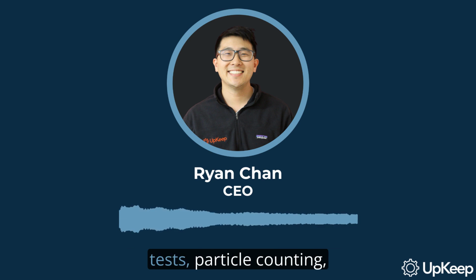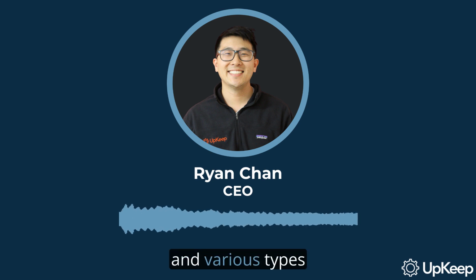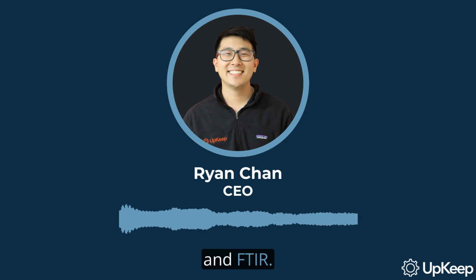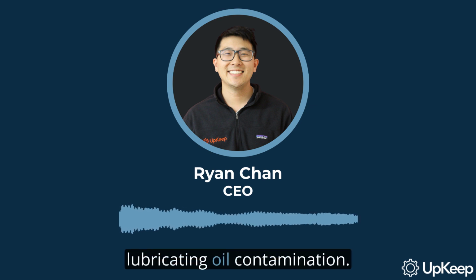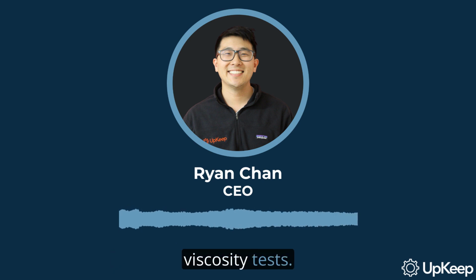Some of the most common ones you'll encounter are viscosity tests, particle counting, Karl Fischer water titration, and various types of spectroscopy, including ICP spectroscopy and FTIR. Here's a fact to keep in mind: about 70% of all equipment failures are related to lubricating oil contamination. That's a huge number, and it underlines the importance of these tests. So, let's start with viscosity tests.